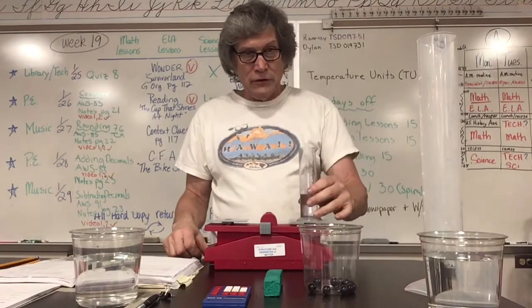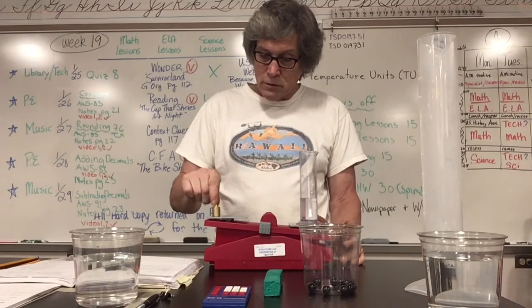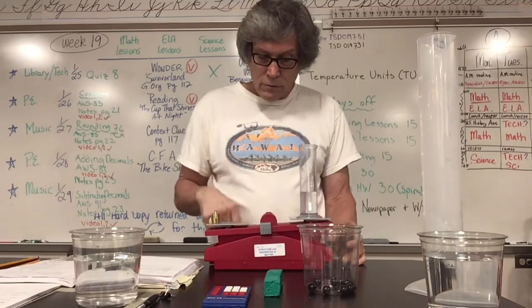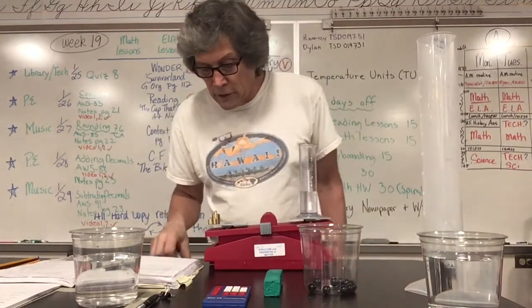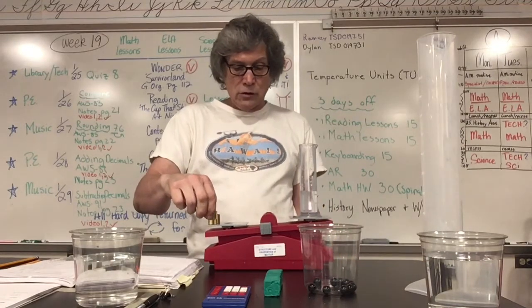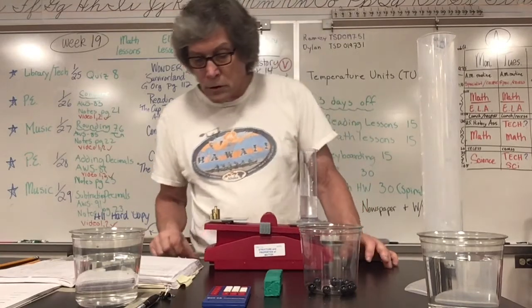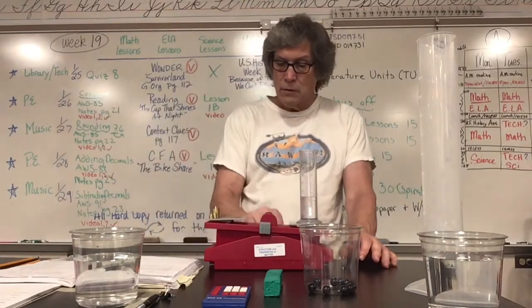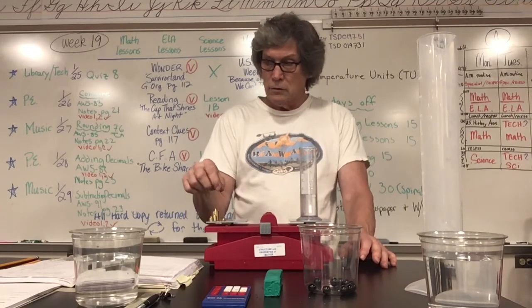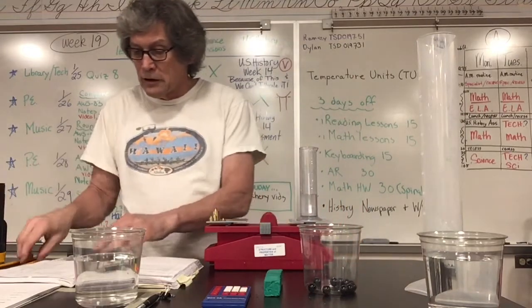I'm going to go ahead and weigh this. Well, hopefully I have enough weights. Okay, so over that's 50, 60, 70, 80, 90's too much. Let's see, 95, 96. That looks pretty close. I'm going to put 96.